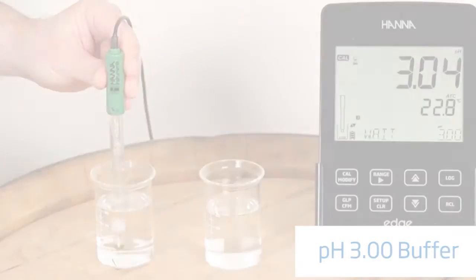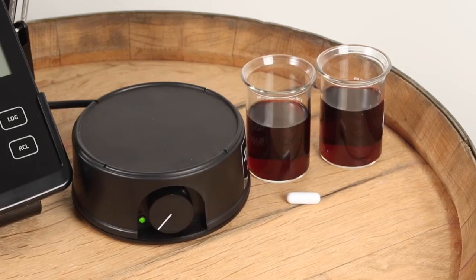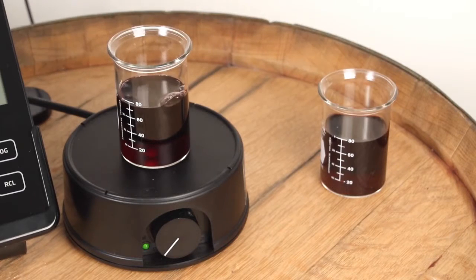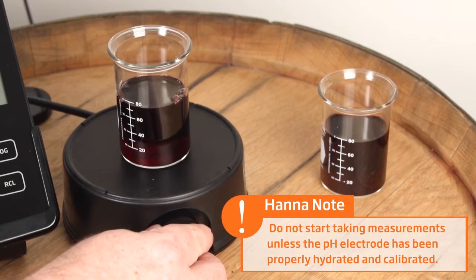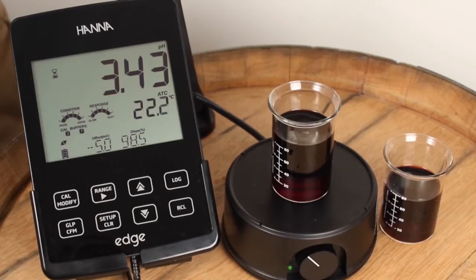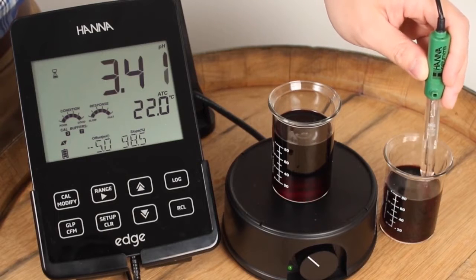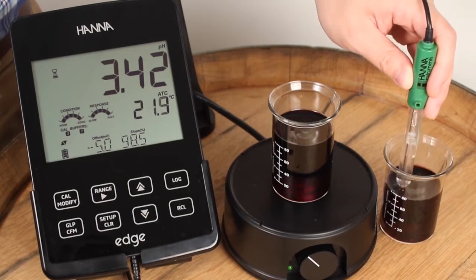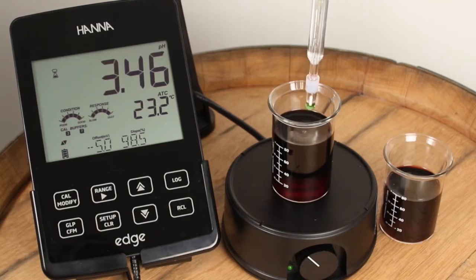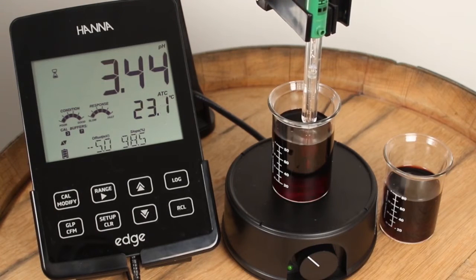Now you're ready to begin your wine analysis. To measure the pH of your wine, we recommend using two beakers filled with enough wine to cover the pH electrode junction. One beaker is used to rinse the electrode and the other is used for your measurement. Be sure to rinse your magnetic stir bar and place it in your measurement beaker. It's important to note that when you turn on your magnetic stirrer, you want the correct speed for best results — if there's a vortex forming inside your beaker it's moving too fast. Once you rinse the electrode in your fresh wine sample, you can place the electrode in the measurement beaker. After about a minute your reading should stabilize and you will have your correct pH reading.